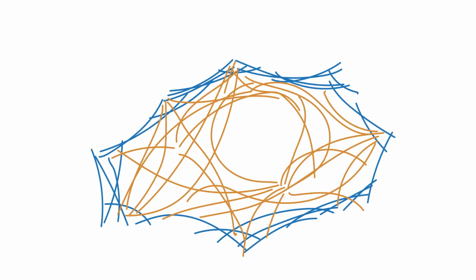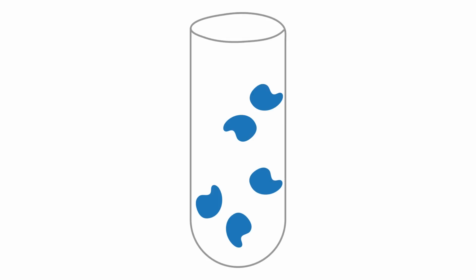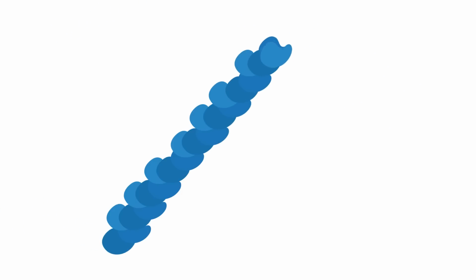Much of our knowledge about the mechanisms that regulate the function of the cytoskeleton has come from investigating the activity of purified proteins in a test tube. A key aspect of cytoskeletal function is that individual subunits can assemble into cytoskeletal filaments, such as actin filaments or microtubules. The dynamics of this cytoskeleton assembly and disassembly are important to understand because these processes are largely responsible for the movement of cellular structures and the mechanical forces that allow entire cells and tissues to move.